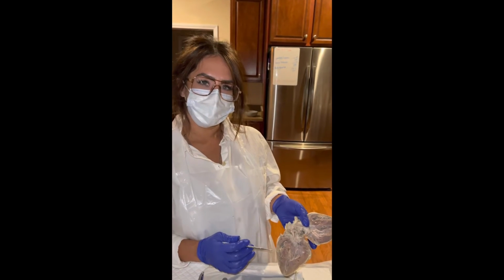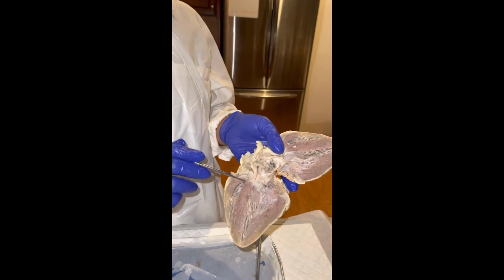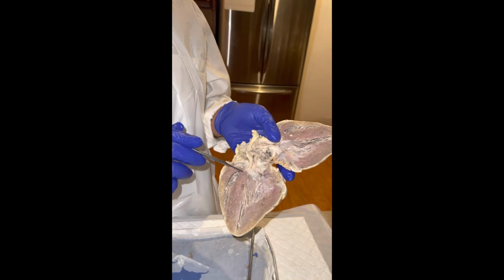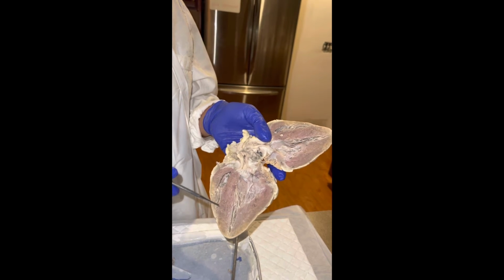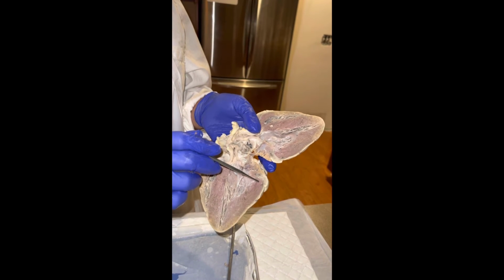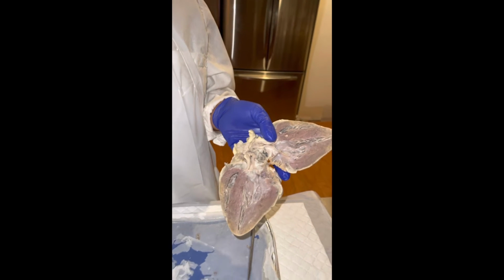Moving right along to discuss the 4 chambers of the sheep's heart, we begin with this chamber right here. So there'll be 1, 2, 3, 4. This first one is the right atrium, right ventricle, left atrium, left ventricle. 1, 2, 3, and 4 chambers in total, just like the human heart.